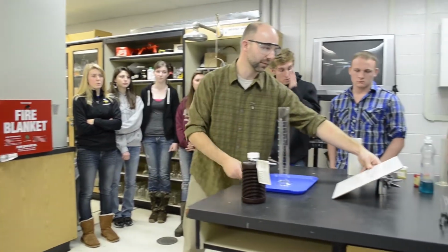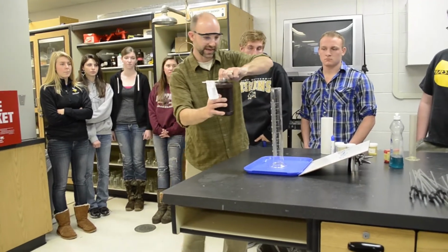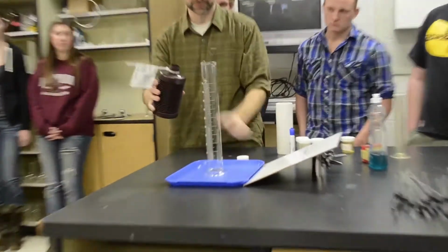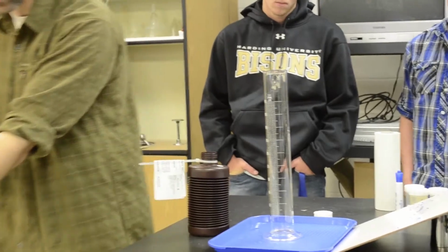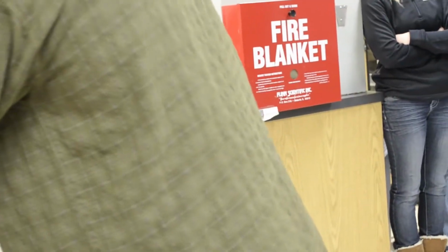Now, if I just take regular hydrogen peroxide and set it in, let's say, a large graduated cylinder, I'm going to dump it in there. Oh, this is, by the way, 30%. And last period I did an unofficial scientific experiment to figure out what would happen if you drop some 30% hydrogen peroxide onto your skin.